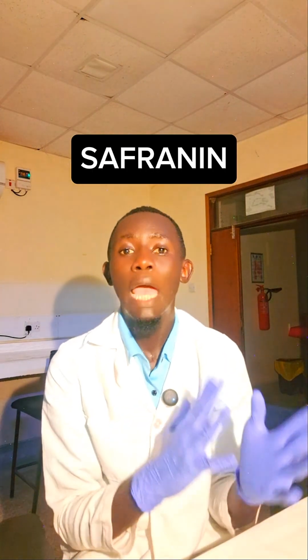Tips. Basic formula, it is just CIAN. C for crystal violet, I for Lugol's iodine, A for acetone, N for neutral red. But remember, we have an alternative. If you don't have the crystal violet, you can use what? Gentian violet. That is another alternative. And for the secondary stain, which is neutral red, if you don't have the neutral red, you can use what? The safranin. So, but the procedure remains as it is for the other staining.